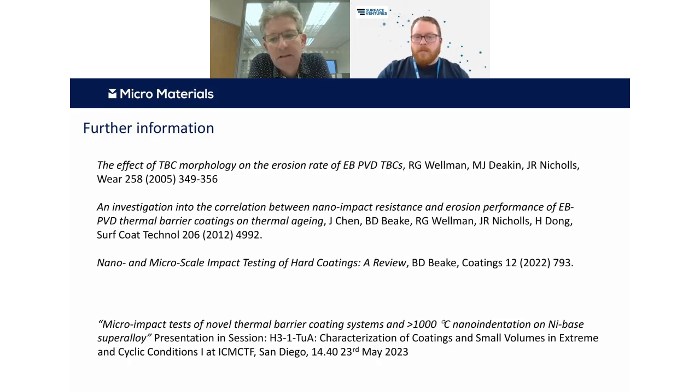You see the adhesion, LC and scratch testing, I see you've put in there. I mean, that again is a parameter that is typically very sensitive to things like probe radius, also coating thickness and things like that. So I personally think LC is quite a useful metric comparing between different coatings, but it's often very little to do with actual coating adhesion. For that reason, there's a lot of things behind that parameter. It's one thing just to be aware that if you think about adhesion as how can you basically pull a layer off a surface, when you're scratching into something, you're actually adding a reasonably complex loading and stressing to the coating structure, so you need to think about that.